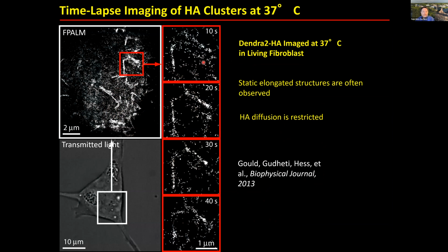We thought at first that maybe this was just a blurred image of a vesicle moving over time. But when we look over tens of seconds, these elongated zones are persistent. And occasionally we do see a vesicle moving, but the majority of events are indeed elongated structures. Why is it that this kind of structure is favored?